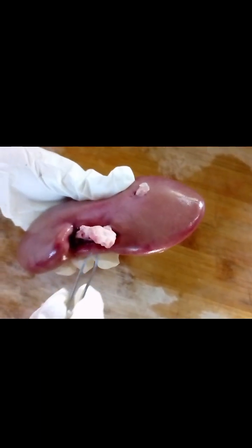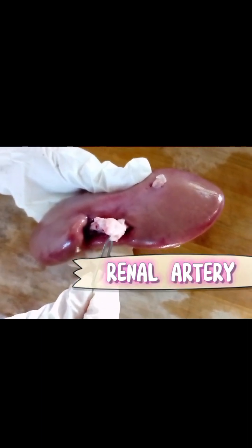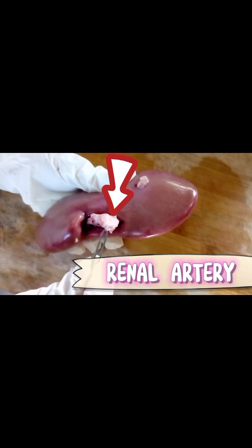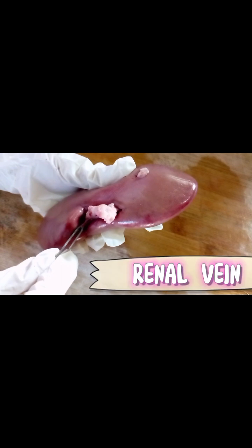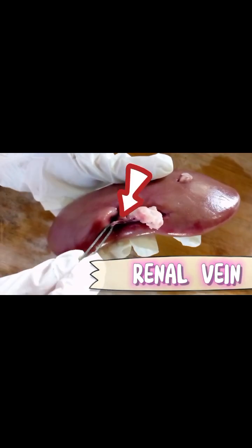Now let us locate the renal artery. The renal artery is where blood enters the kidney. Now let us locate the renal vein. This vein is where blood exits the kidney.